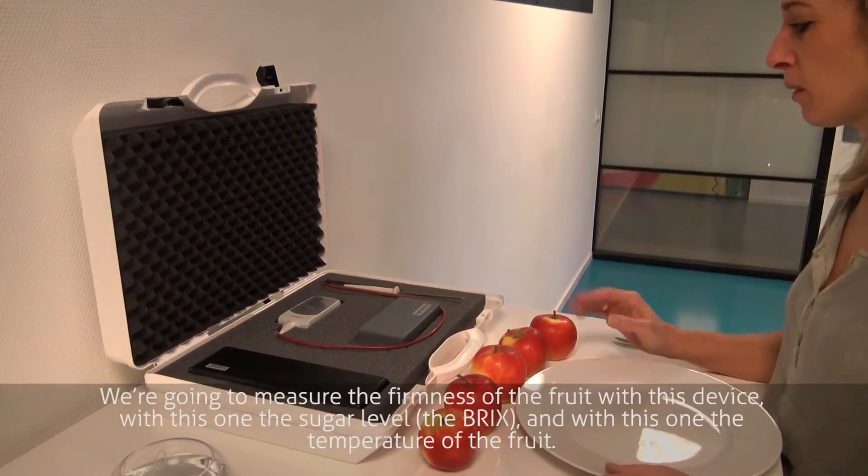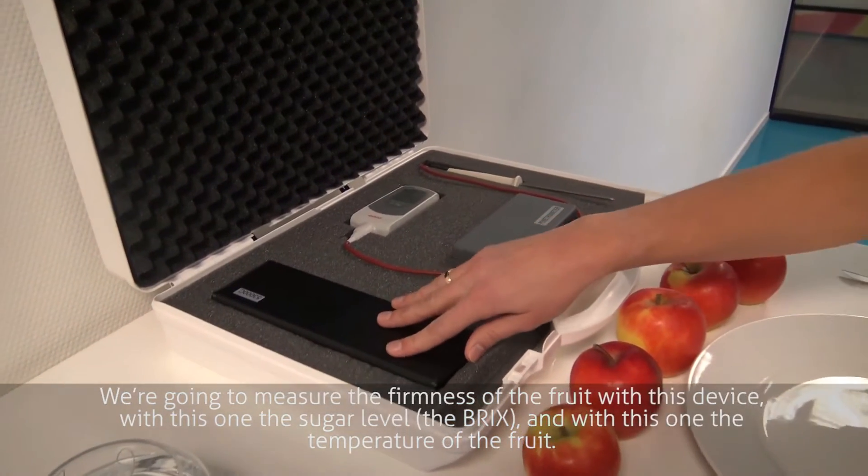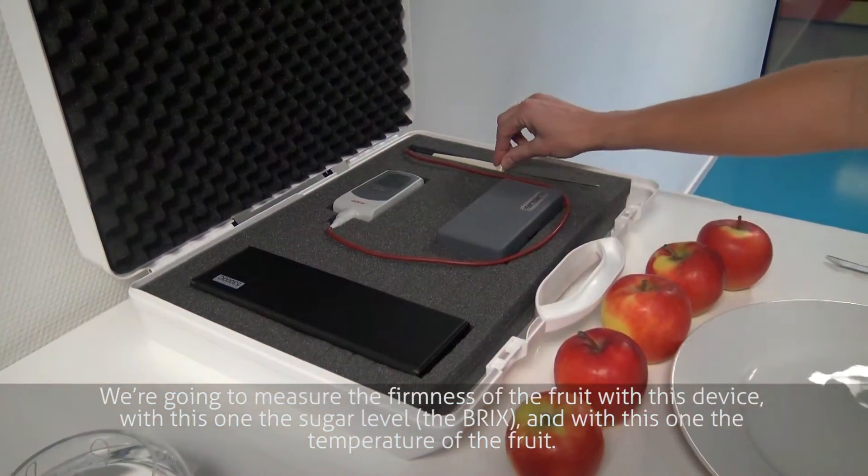This is the fruit quality box. We are going to measure the firmness of the fruit with this device, the sugar level and the Brix with this one, and with this one the temperature of the fruit.